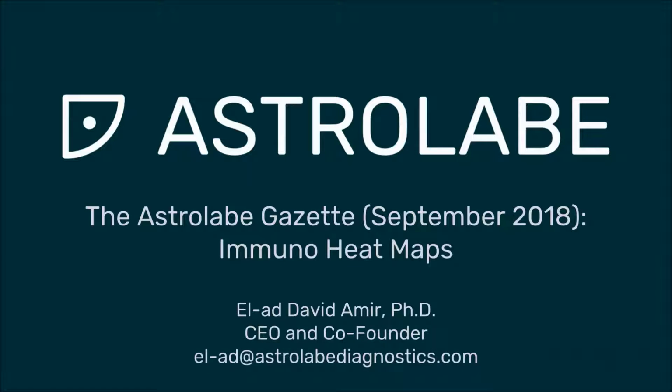As always, we have several new additional features in this month's Gazette, and I encourage you to go through the entire email to see what's new. Notably, we've sped up both the data science side of Astrolabe and the interface side. So running experiments should be much faster, and navigating through them should be faster as well.